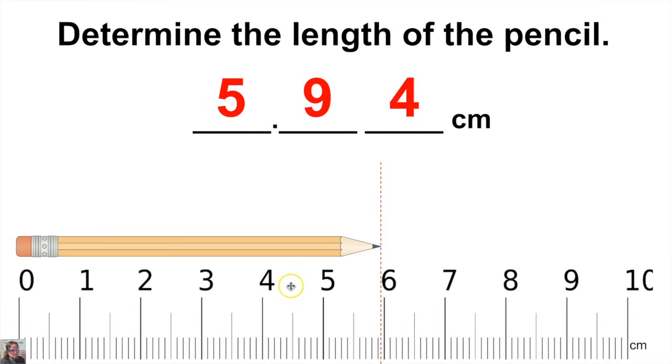centimeters. So keep that in mind, that when we take measurements of length, we have to measure one significant figure beyond the level of precision of the instrument that we are using. Let's now switch gears and see how we're going to measure mass next.